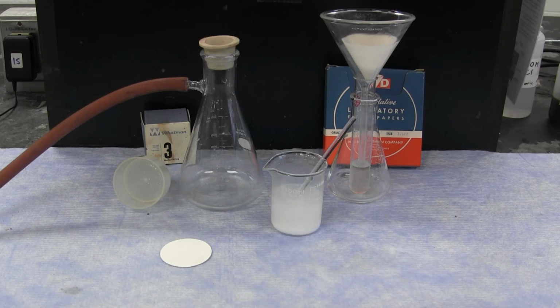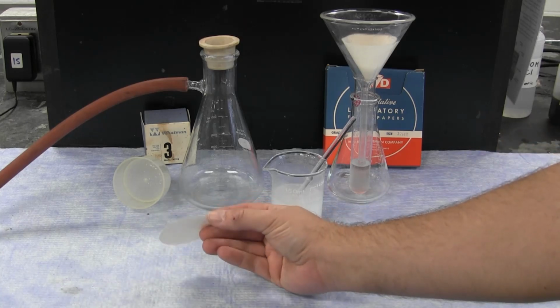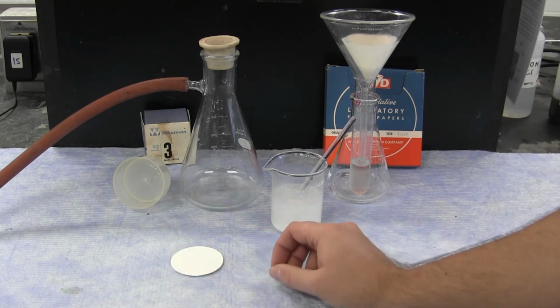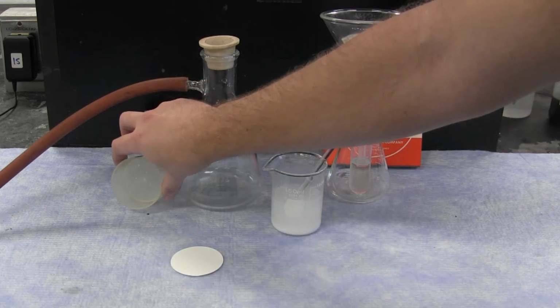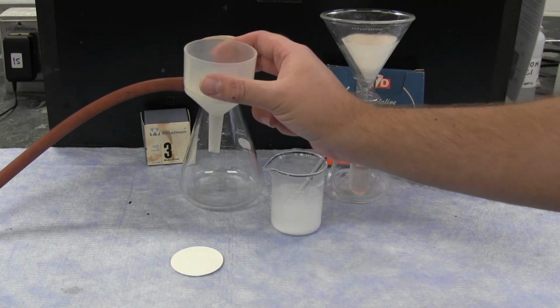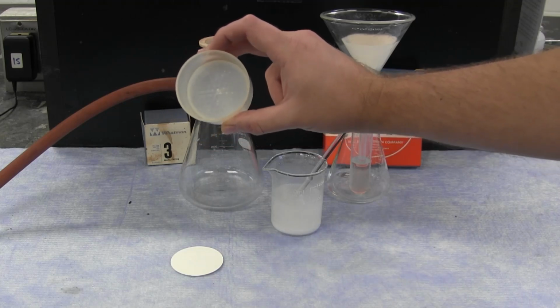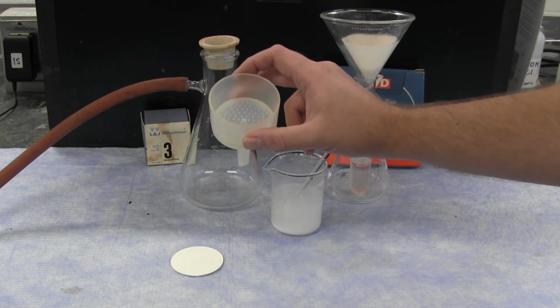The second type of filtration using filter paper is through vacuum filtration. In vacuum filtration, the filter paper itself is generally smaller and not folded, and stays a whole circle. These circles of filter paper are then used with a special type of funnel called a Buchner funnel. This funnel has straight sides on it and acts like a container. Inside is filled with a number of small holes. This holds the filter paper so it doesn't pass all the way through.